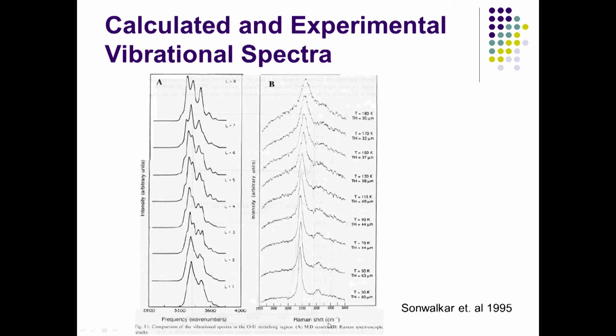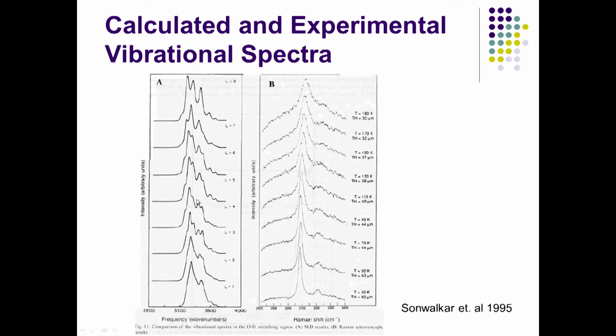So, if you look carefully on the right hand side, which is the Raman shift, the experimental data, you can see this sharp peak is the in phase, and again we are looking here at OH stretching. So, we are looking at the molecular level, but looking at each atomic vibration. So, here you are seeing that this is OH1, this is OH2, this is nu 1 and this is nu 3, and we are looking as we go from 30 degrees to 50 degrees, 70 degrees Kelvin. So, we are at very low temperatures. This is cubic ice that we are looking at, and in this case we are looking at the cubic ice again with the laser and with molecular dynamic simulations.